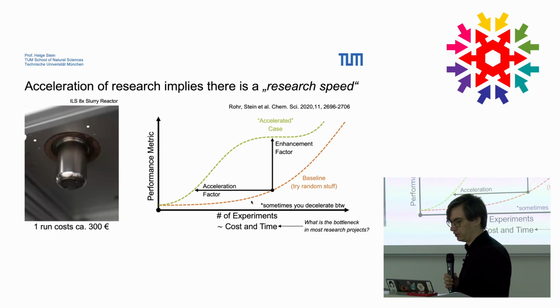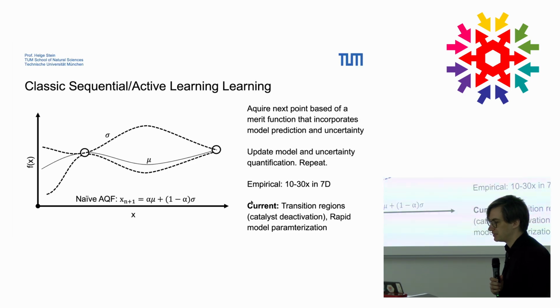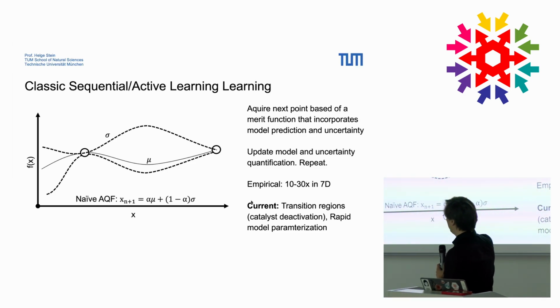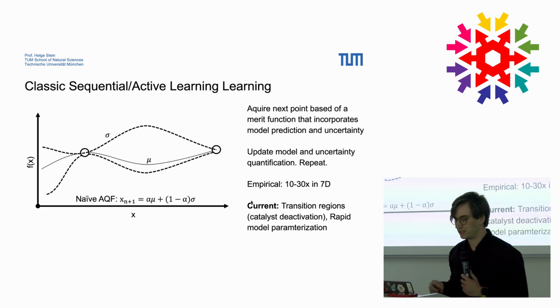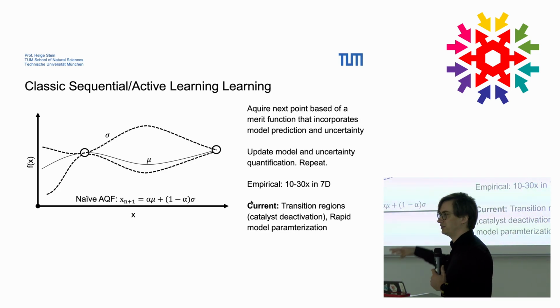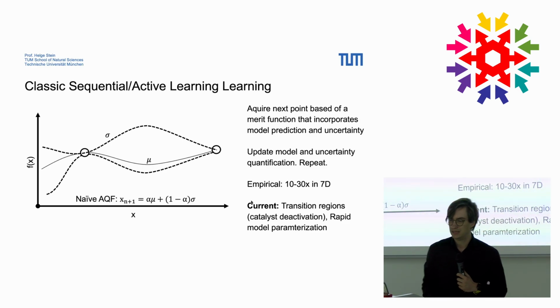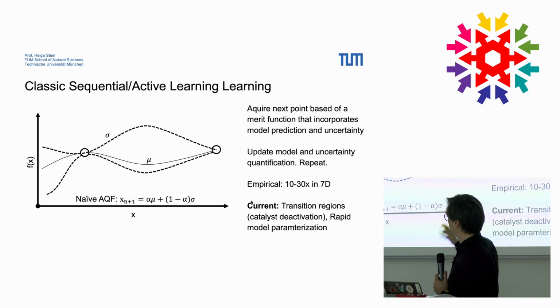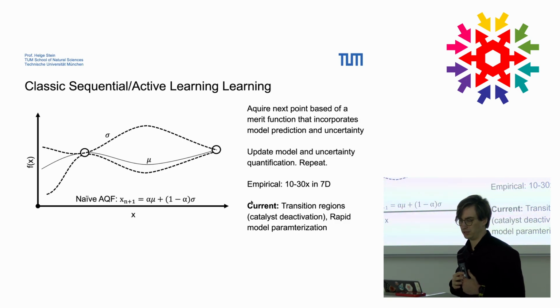So how does this whole thing work with active learning? The basic idea is, if you have 2 points, you measure them and you assume that nearby your point you have a low uncertainty. So where should you go next? You can either do a space-filling design, so in this case it would be right in the middle. Or you simply go where the model that you train is the most uncertain, or you do a combination of both. That is, you try to have a space-filling design where you also reduce overall model uncertainty.